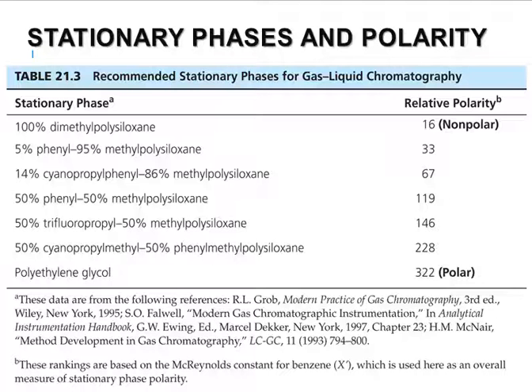How lopsided is it? What I play off of are the strict boiling points. That's about it, right? The ones with lower boiling points turn into a gas first, and those come through the machine first. It's as simple as that.